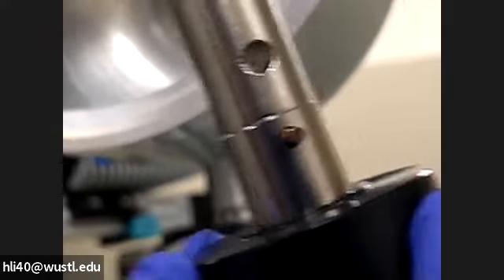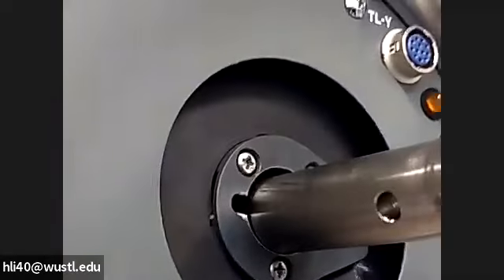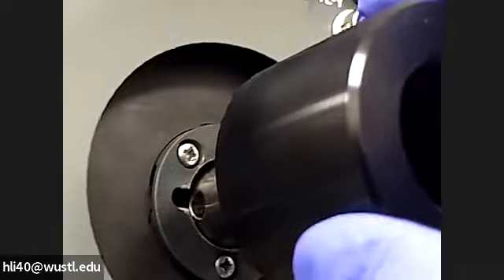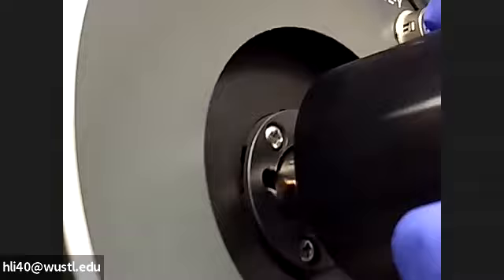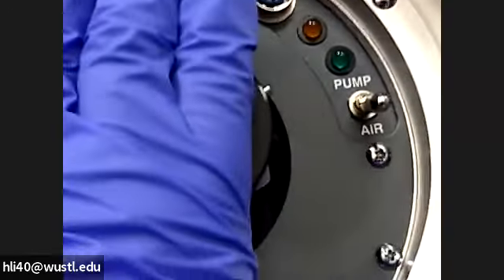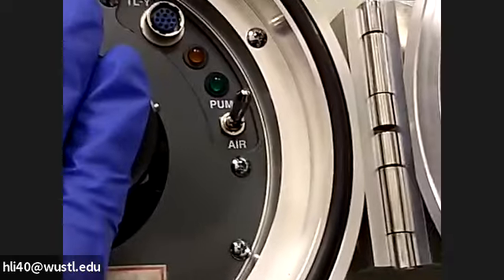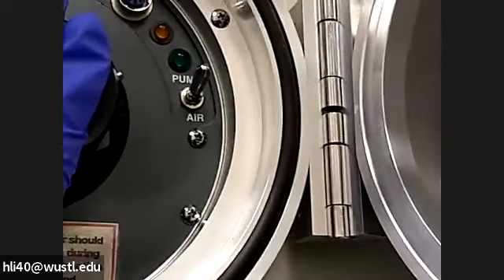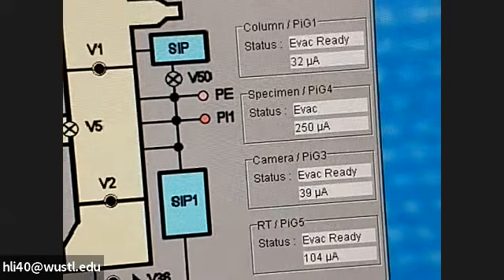You load the dummy holder using the same procedure as loading the real holder. Your dummy holder has a little copper pin there. You need to align the copper pin to this gap here, which is about the 9 o'clock position. You see the gap. So you just simply align and push. You use your left hand to push, right hand change from air to pump. The numbers should start going down.